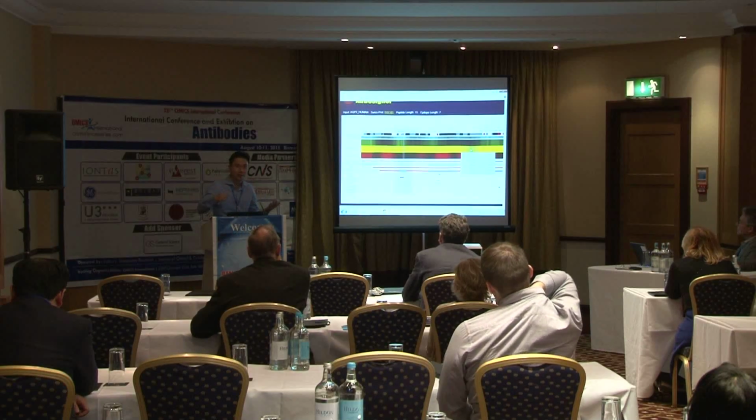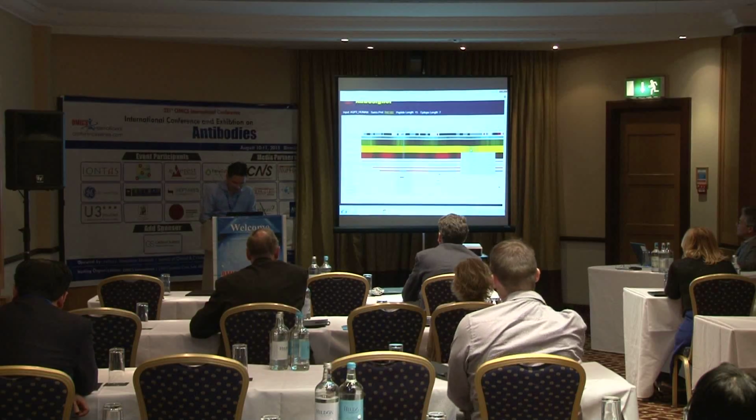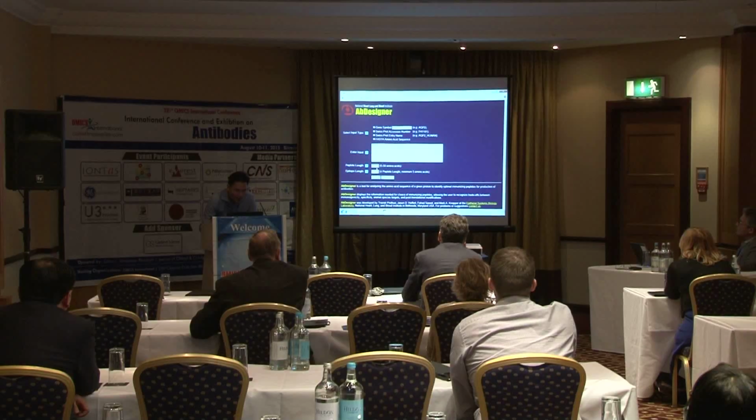And if you had to run this by BLAST, you don't want to do that. You would have to run like 100 BLASTs. So this tool allows you to visualize the whole sequence. Can you easily vary the peptide length window? Yep, you can. You have to change this one and run again. It takes like 15 seconds. Great, yeah.